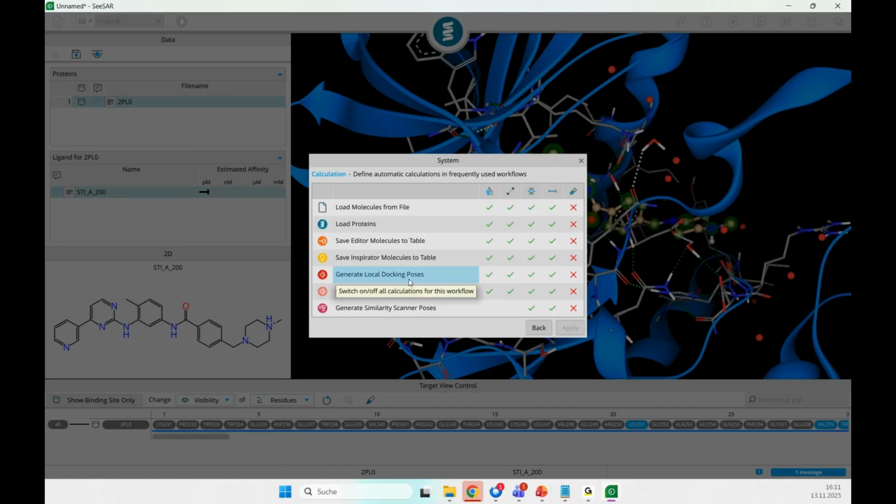So let's assume you would like to dock poses, but don't want to perform any HYDE optimization because you would run an additional algorithm to rescore them without any additional subsequent adjustments of them. So you can turn it off. This includes also calculating the H-bond network and also clashes and torsions.